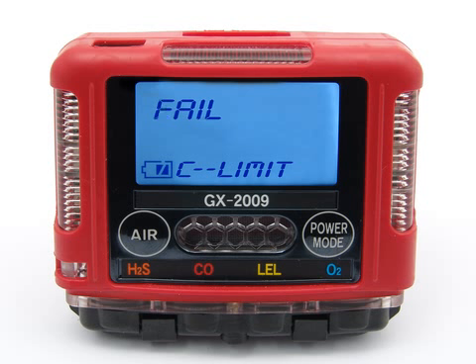If the unit is due for calibration and the Cal Limit check is set to can't use, then the fail Cal Limit prompt is displayed. At the same time, the alarm LEDs and buzzer will pulse several times. The fail Cal Limit prompt will remain on the display until the unit is turned off. The GX 2009 cannot be used until a complete calibration has been performed.